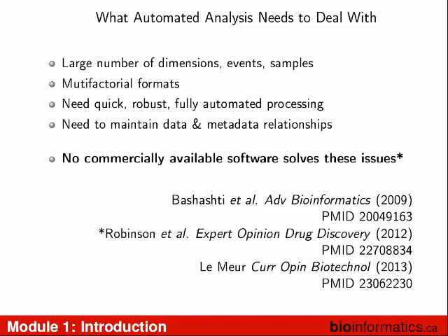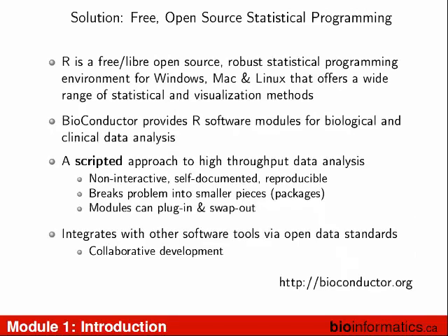We did a review back in 2009 that described some of these tools. This is a really good paper that just came out this year by Noel Nemure, someone I used to work with, who reviews all the flow cytometry R packages that are out there, at least most of them. Paul Robinson's paper gives you a bigger overview of flow cytometry data analysis, as well as our paper. We didn't want to give you a reading because that would spoil the whole story. But for backup after you go away, I think these are three really good reviews, if you're still excited after two days, you can go read more.